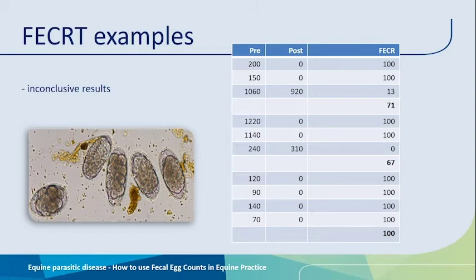And it might be, but we just can't rule out, depending again on what egg counting technique we used, whether or not this is a true 100% reduction, or whether the reduction was less than 100% but just didn't get detected by the egg counting technique. So just a few considerations when you get these inconclusive types of results that are likely to happen out there in the real world. It's rarely just black and white. Unfortunately, we're dealing with variability and small group sizes, but at least here are a few suggestions for you to consider when you interpret the results.